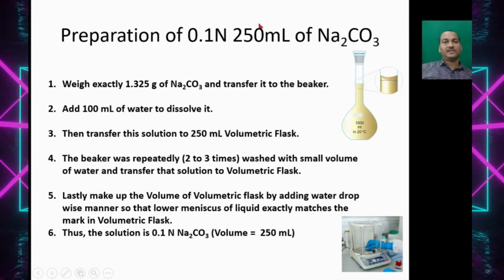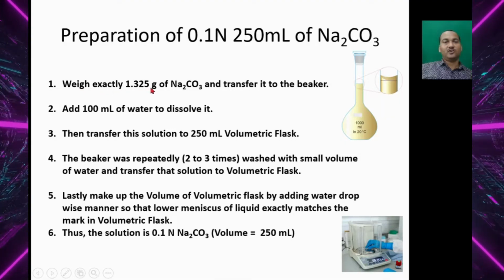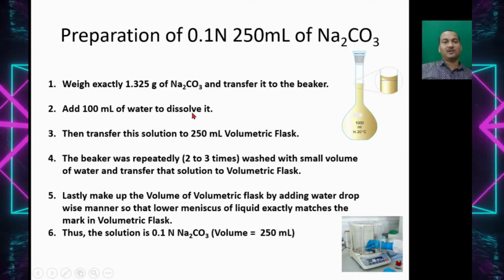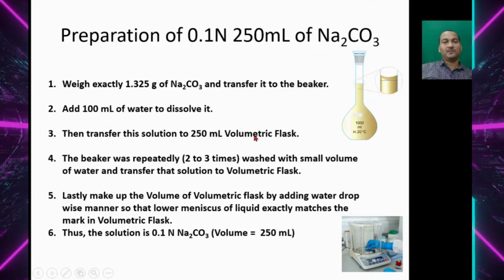So this is the procedure you need to adopt. Weigh exactly 1.325 gram of sodium carbonate and transfer it to the beaker. Then add approximately 100 ml of water to dissolve it. Then transfer the solution to the 250 ml volumetric flask.